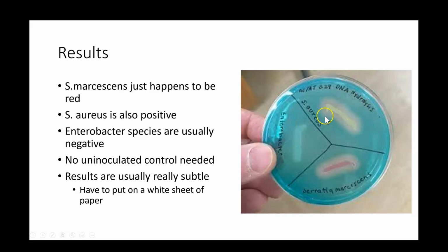And what tends to happen is if this is a fast-growing bacteria, it'll create that halo within, like, say 12 to 16 hours. And then in the next 8 hours to 24 hours, like say you don't look at it for 2 days, that methyl green will just kind of like diffuse back into the agar and kind of make this halo not as clear. So timing is kind of important in the DNase test, simply because it's so easy to get a false negative.